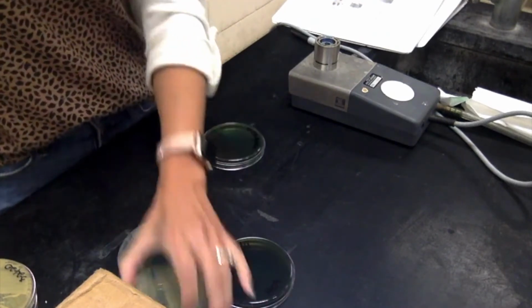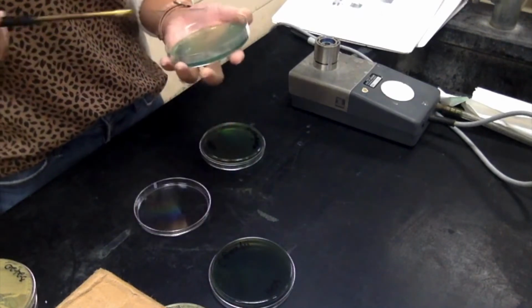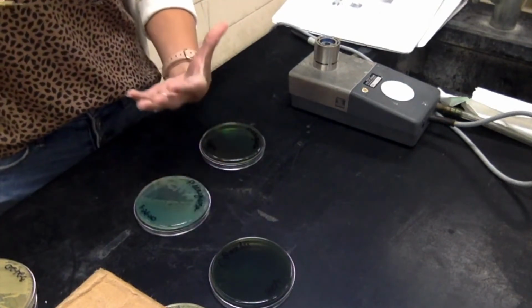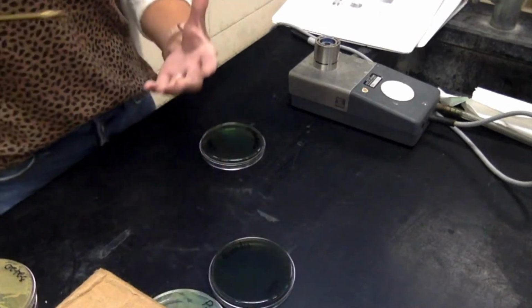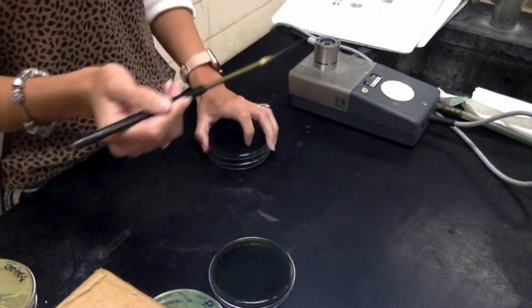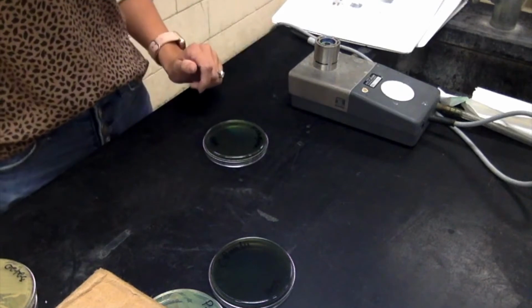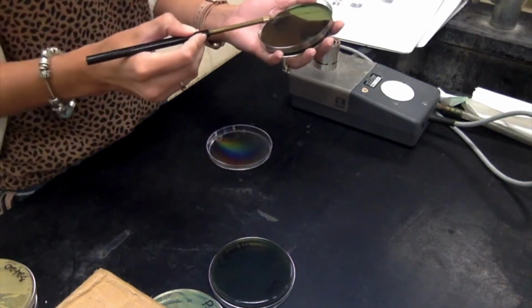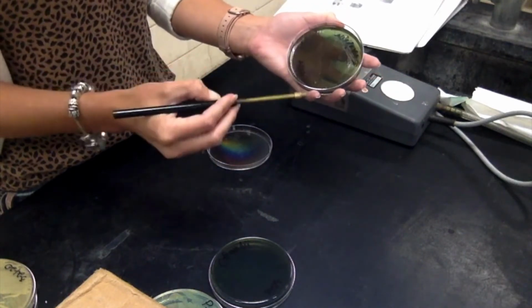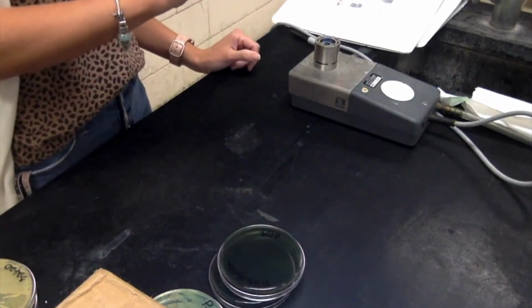And lastly, my Pseudomonas. All right, so now we're completely finished with inoculating all of our plates.